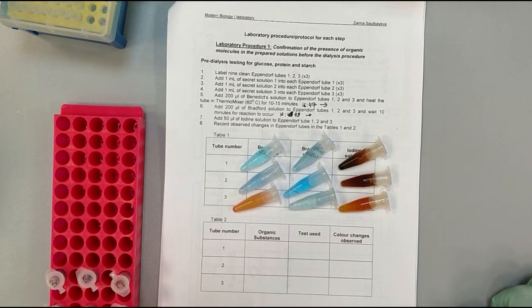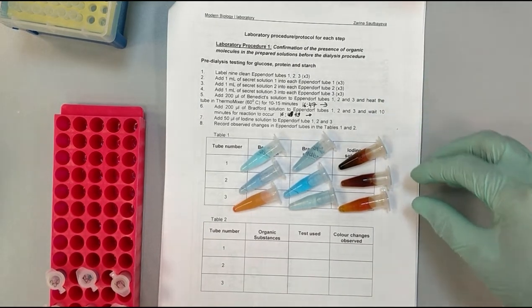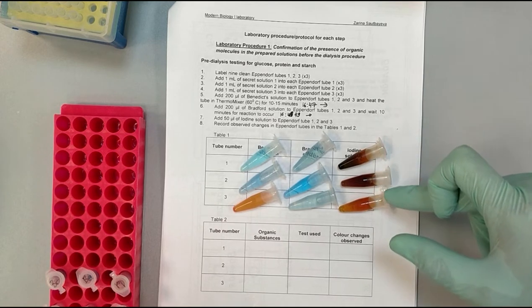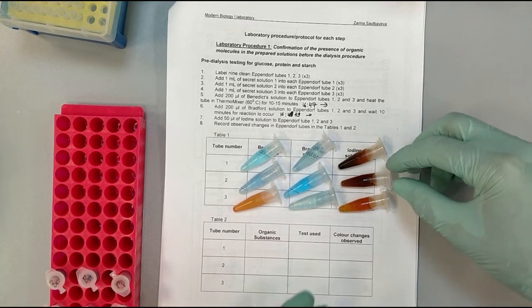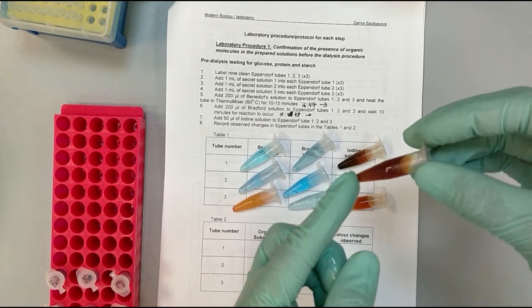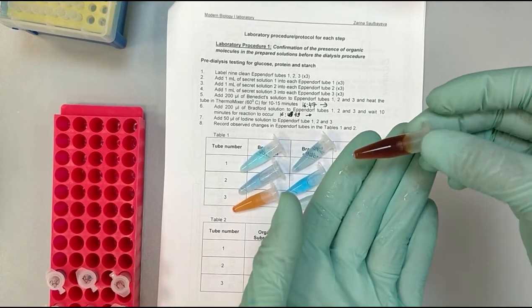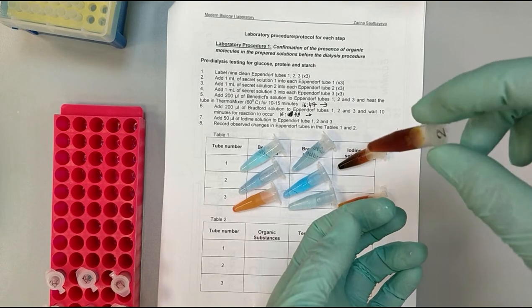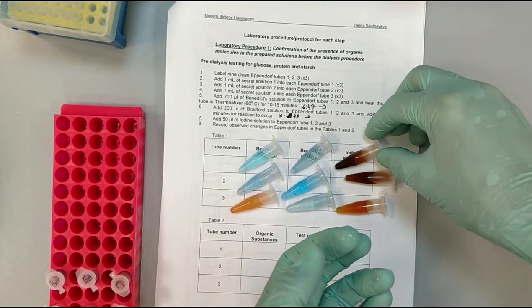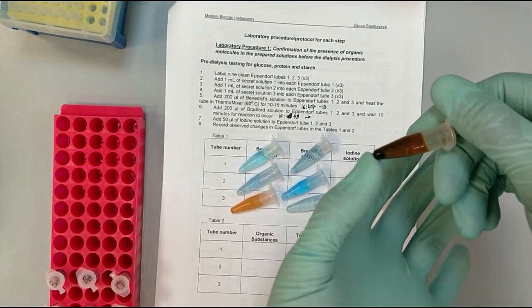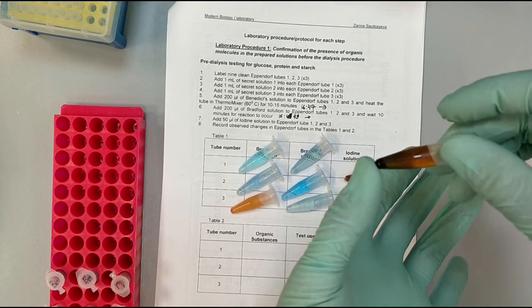So now you need to make your conclusions on what reactions happened in what tubes, so that you can write them down. So on the video, you might see these two tubes being identical, but it is not true. And if you look closer, you can see that it is actually dark, but transparent, while this has black sediments and it is not homogeneous anymore.